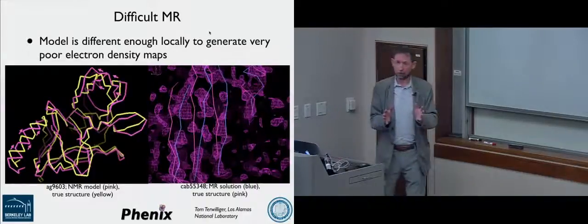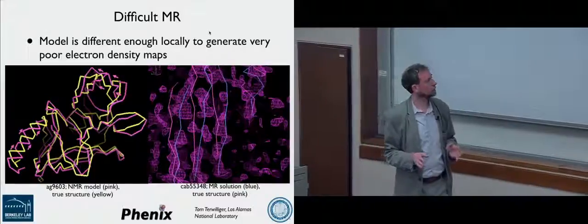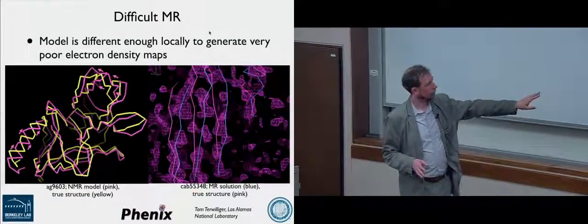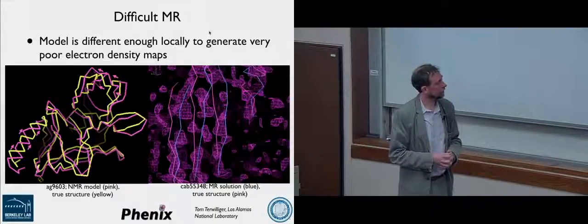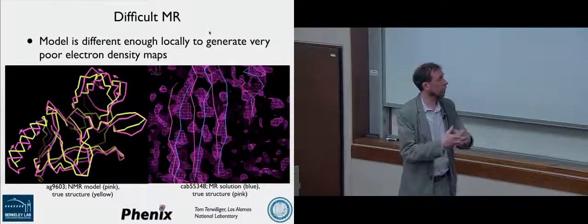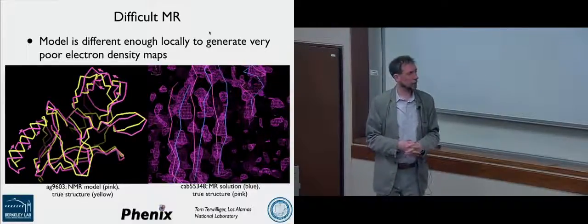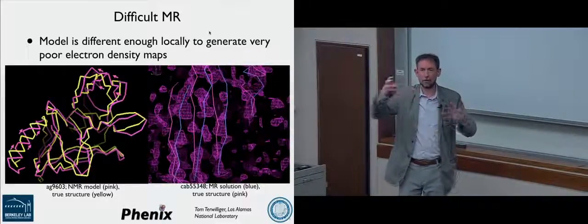So that's one approach. And in the last 5 minutes, I'll describe a different approach, which Tom developed. Let's go back to our NMR example here, where yellow is the true answer and purple is the molecular replacement model that we placed. If you look at it, what you might notice is that a lot of the differences are not because things have changed secondary structure or conformation.